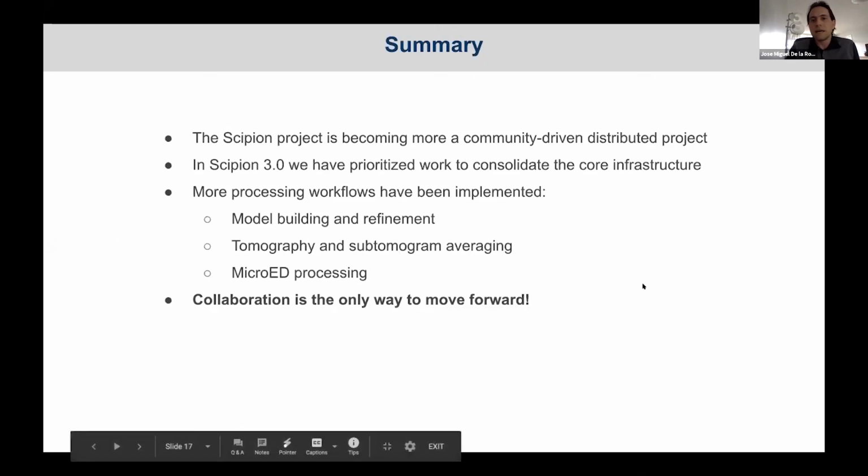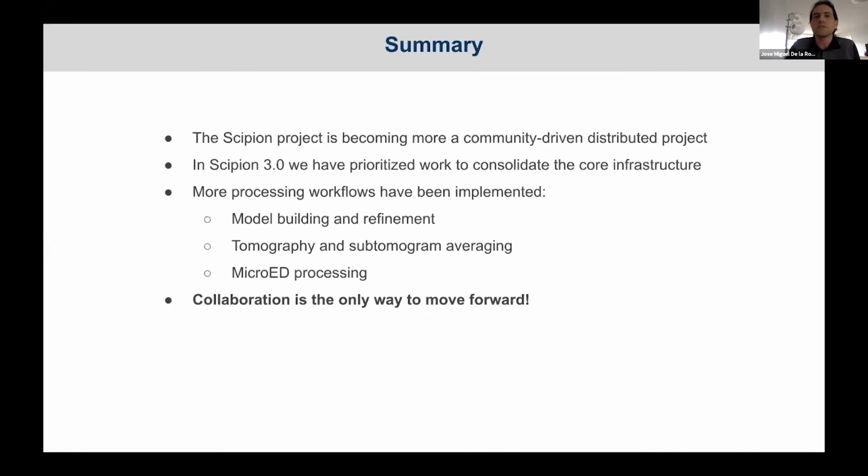And for this new release, we have put a lot of effort into infrastructure work. This is not the most attractive from a scientific perspective, but I think it's very important to consolidate the ground to start building on top of it. And of course, this hasn't prevented us from continuing to develop new workflows and new methods, like for model building, tomography, and MicroED. And I hope that improving this framework will attract more developers.